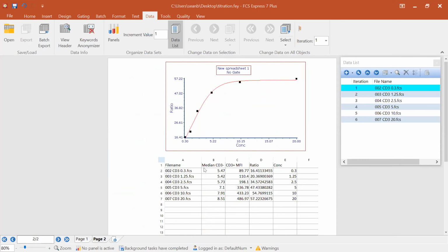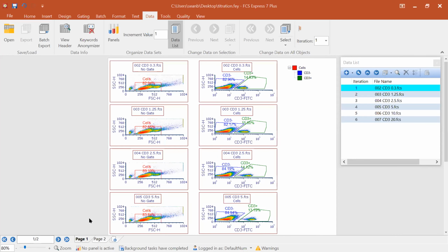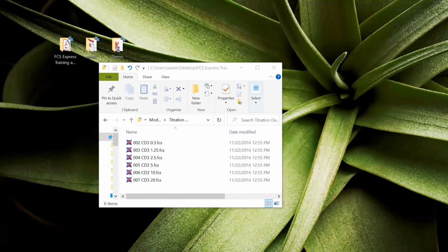Sure, we did a lot here with just a very basic analysis. But that being said, if there are any questions about anything I have open now that we want to take a quick look at, just type a quick question in the chat window or raise your hand. We can address a few questions here before we go on to the immunophenotyping, to show you the other workflow. I don't see anything coming through just yet, and if I do, I can always come back. We can always spend some extra time on that.